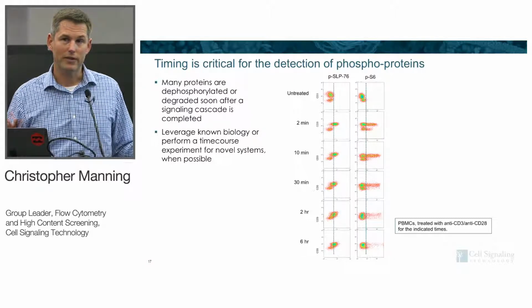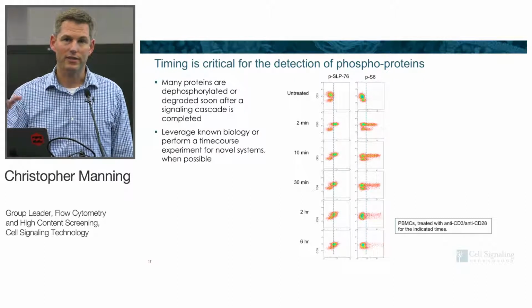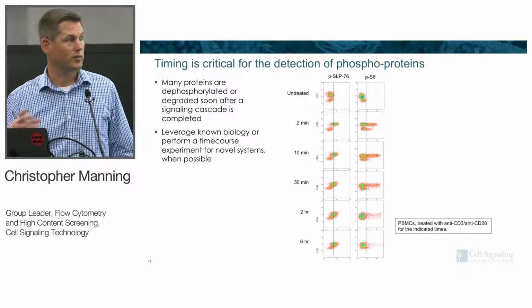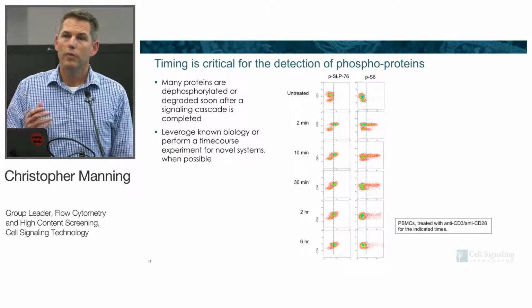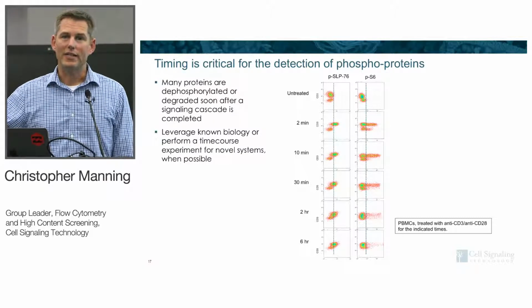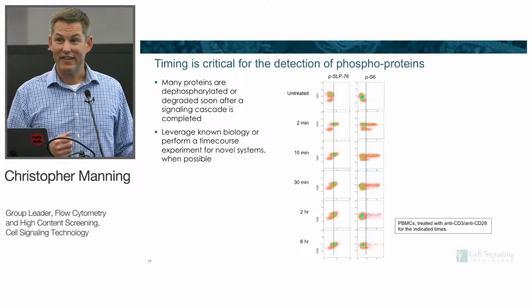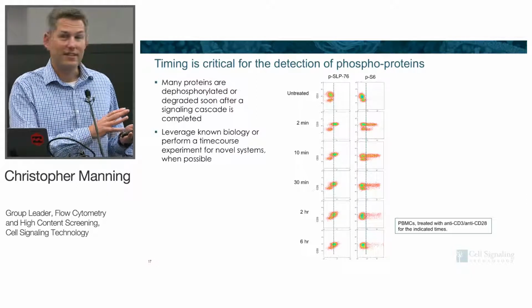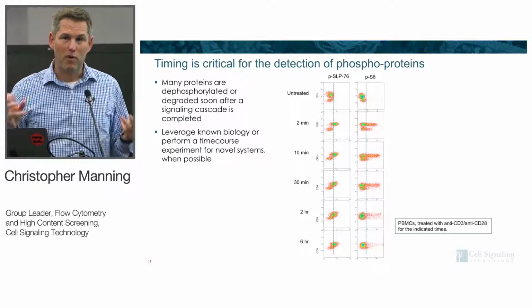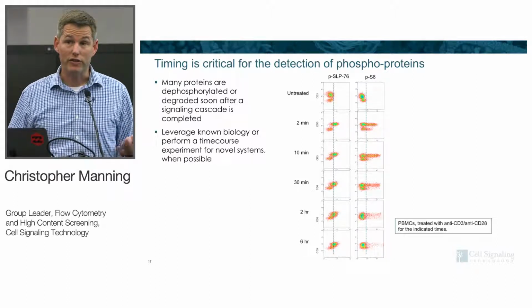And S6, which is phospho-S6, is an indicator of cell proliferation. This site is phosphorylated when cells are growing and proliferating. Again, comes on very quickly and is gone. So we get questions, hey, I activated my T cells for 7 days and I don't see any phospho-SLP76 signal. Yeah, you're 7 days too late. So be aware that some of this isn't a permanent mark. These things come and go on the proteins very rapidly. So understanding the biology of your system is important.